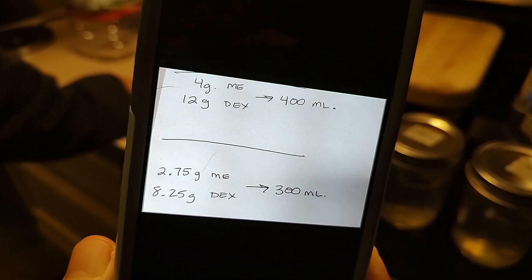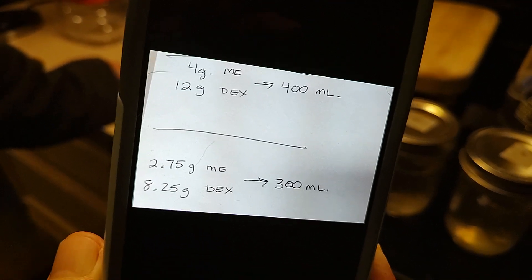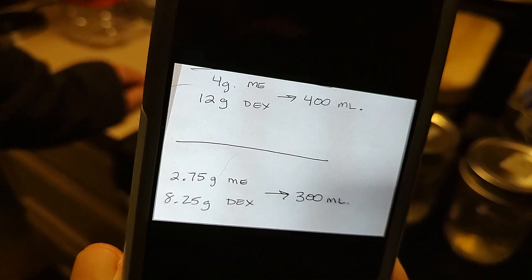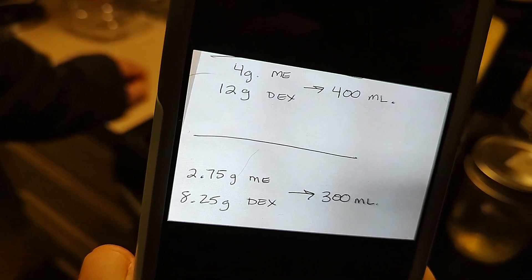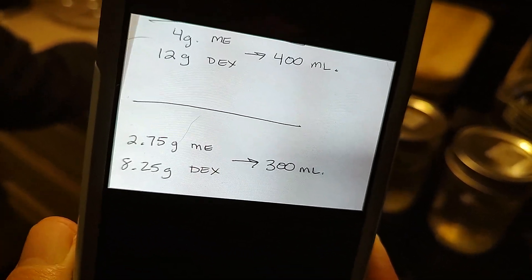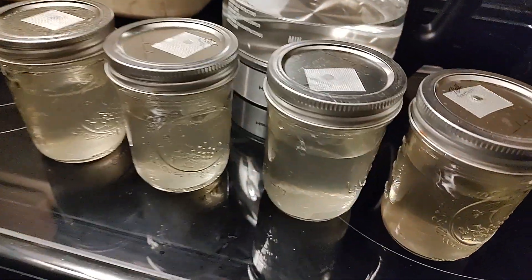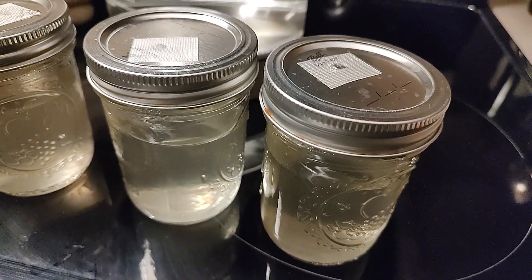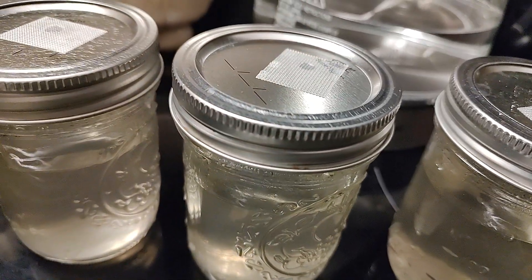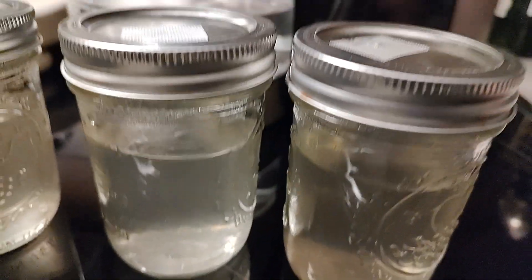Here's the recipe for the LC: light malt extract and dextrose with purified clean boiling water. We're going to pressure cook this for 30 minutes at 15 psi. After pressure cooking, we'll be dropping transfers in and then stir to break it up.